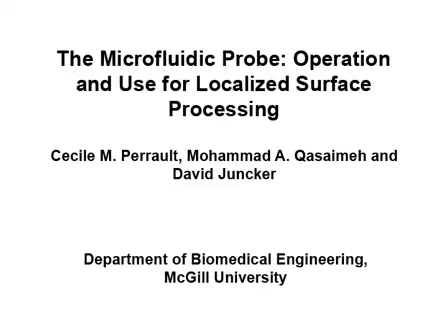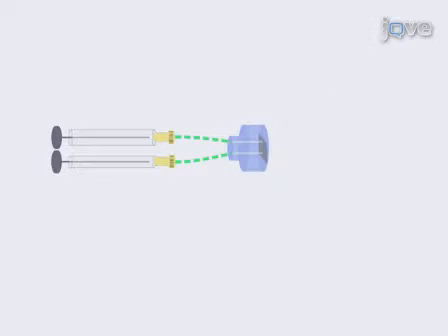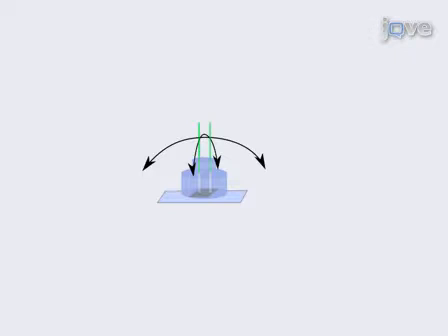This procedure shows how to assemble and use the microfluidic probe, or MFP. The microfluidic components of the MFP are gas-tight syringes, glass capillary tubes, microtite connectors from Upchurch, and the MFP head. This video will present the critical steps of assembly and alignment. Once assembled, the MFP can be used with a large variety of substrates and reagents for surface patterning and processing.